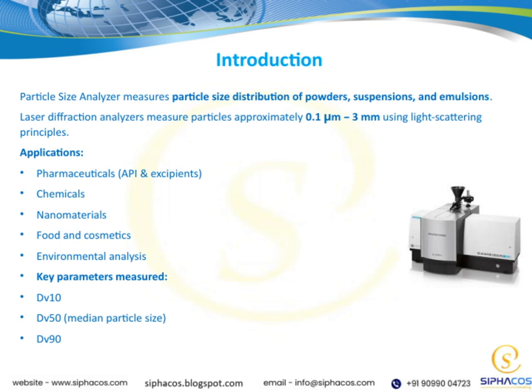When we measure these particles, some key parameters we focus on are dV10, dV50, which is the median particle size, and dV90. These parameters give us a clear picture of the size distribution within a sample. Overall, understanding particle size is fundamental because it impacts product performance, quality, and safety across so many fields.